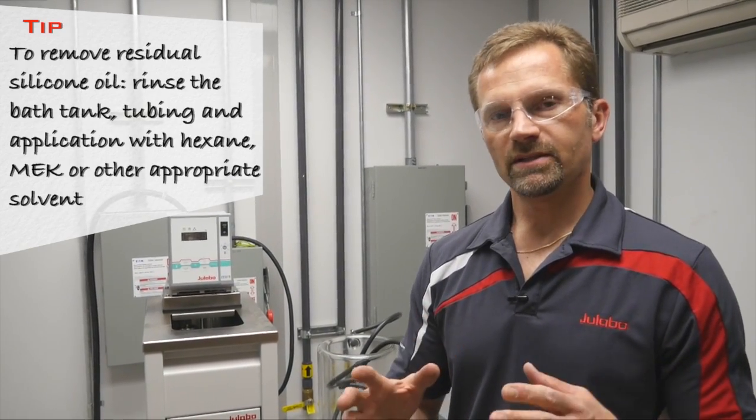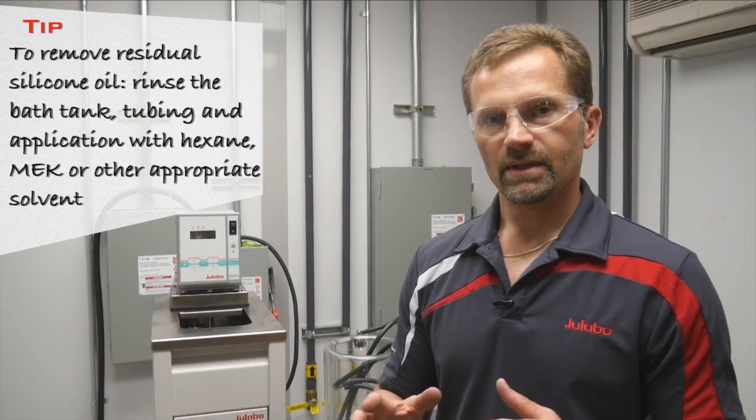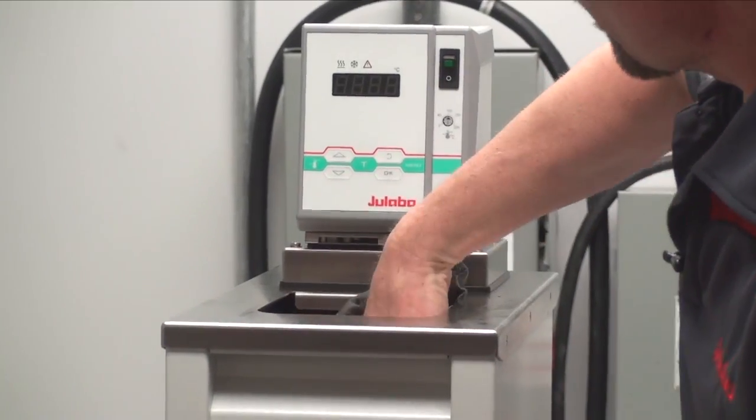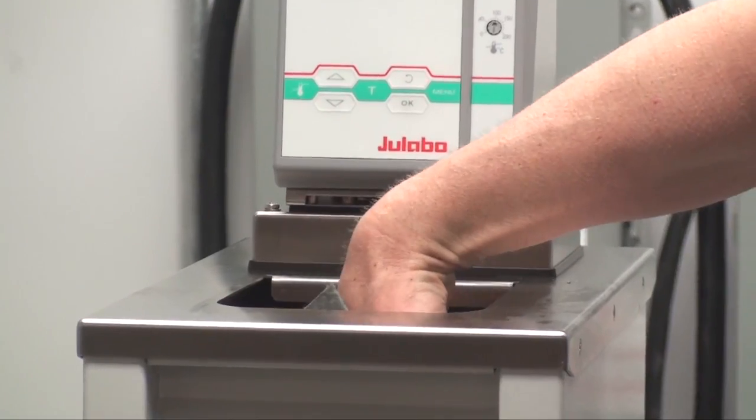In the case where you have dissimilar fluids — for example if you were switching from silicone oil to water or water glycol — you want to remove as much of the silicone residue as possible. So in this case I added some ethanol to the bath tank and I'm simply going to wipe it out and dry it out as much as possible.